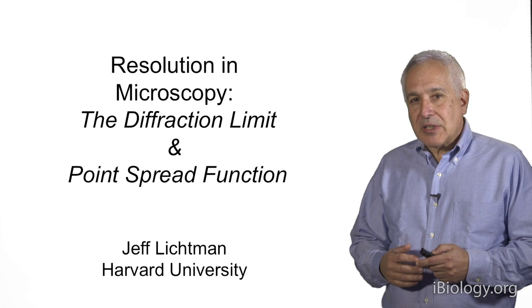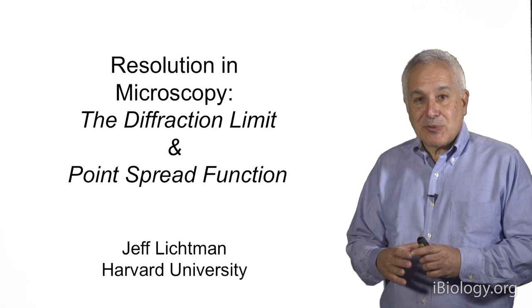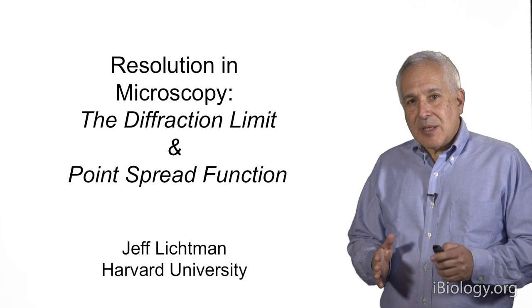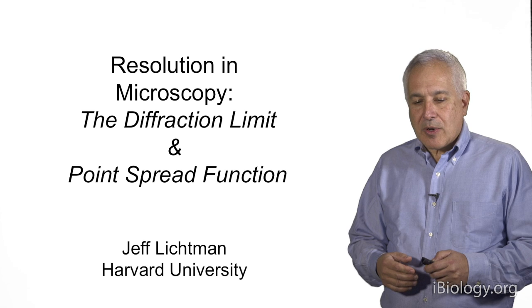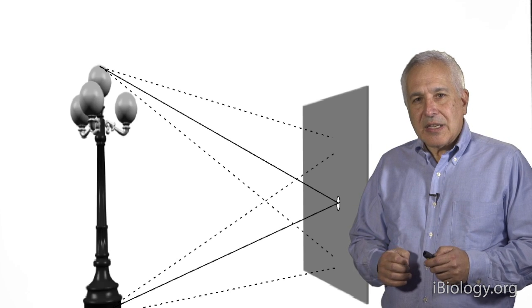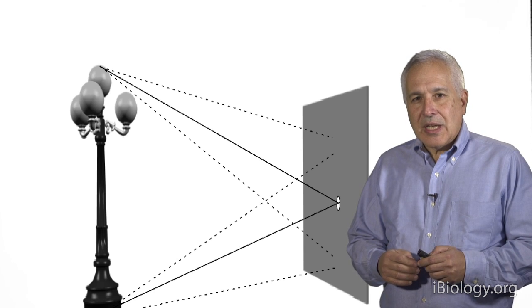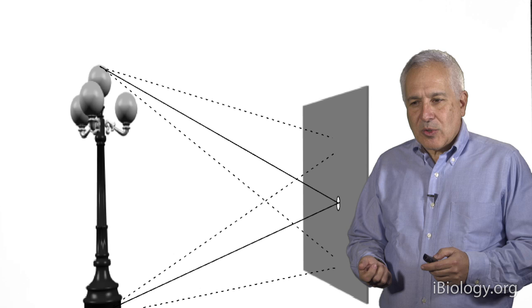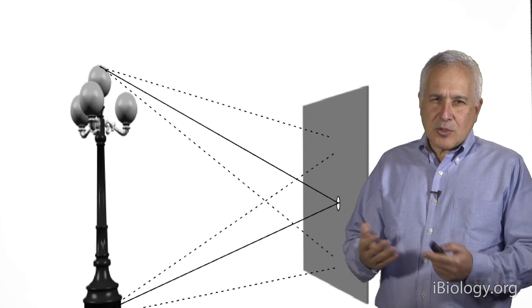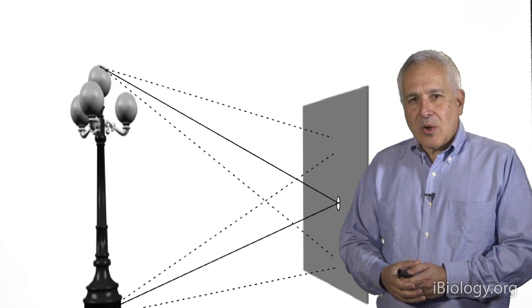This diffraction limit ultimately leads us to an irresolvably small spot of light, which is based on something known as the point spread function, that limits the resolution of traditional forms of microscopy. So to begin, I think we have to talk about why light doesn't behave in a way that would allow infinite magnification. For most of us, anyone who's held a laser pointer, you get the impression light travels in straight lines, and that it should be very straightforward to understand where light goes.